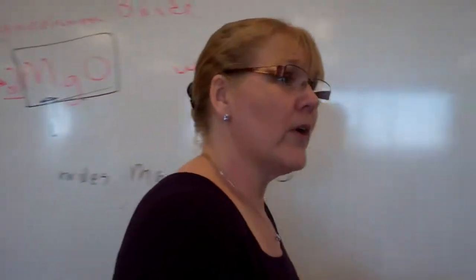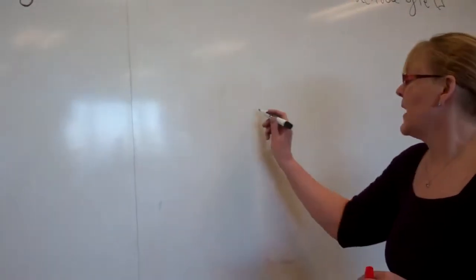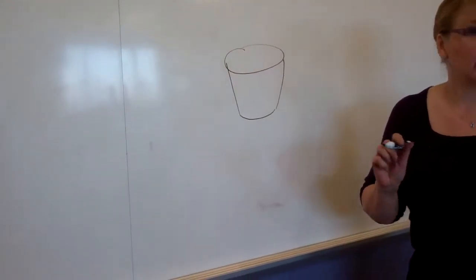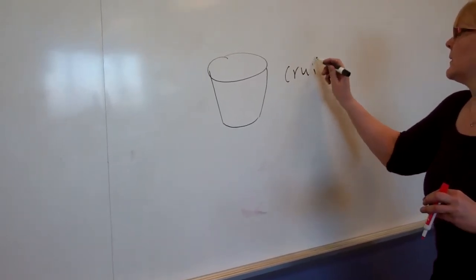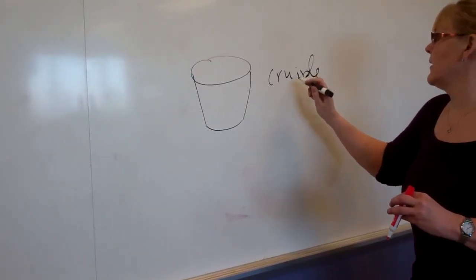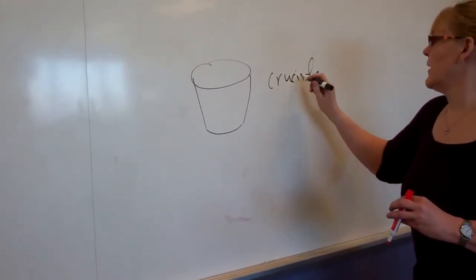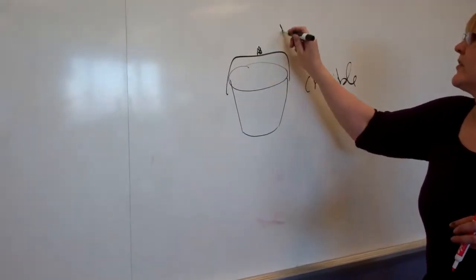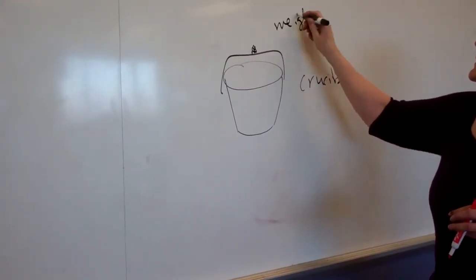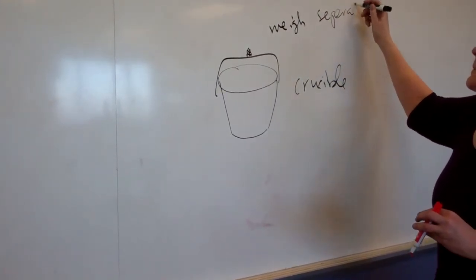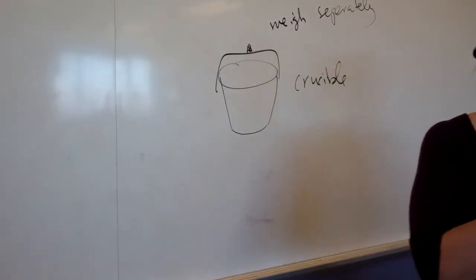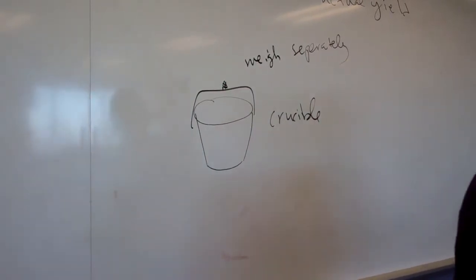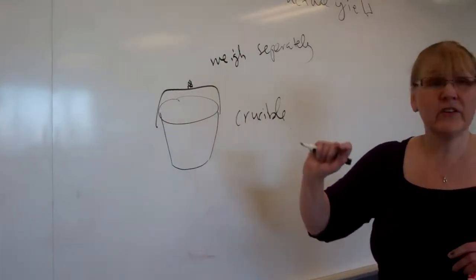To do this we are going to start out with a crucible — a nice porcelain container — and we're going to need a lid. I would like you to weigh these separately. You can also weigh them together, but we need them separately because the most common thing we do in this experiment is drop and break the lids. So weigh these separately.